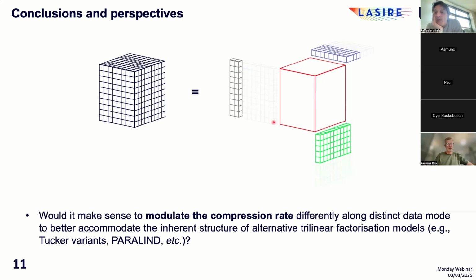I'm not sure if in three-way that's the case, because we have never collected data on systems more complex than 4 or 5 components. Actually, when dealing with fluorescence techniques, it is already particularly complicated to get images or data underlying 3 or 4 fluorophores, so thinking of increasing the number of spectroscopically active chemical species is a bit complicated for us.